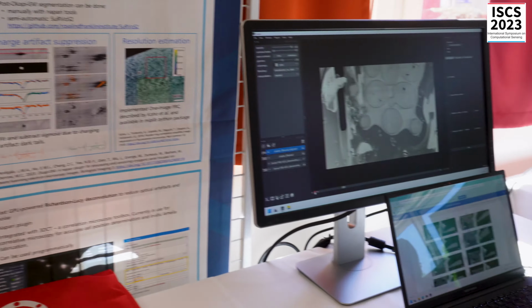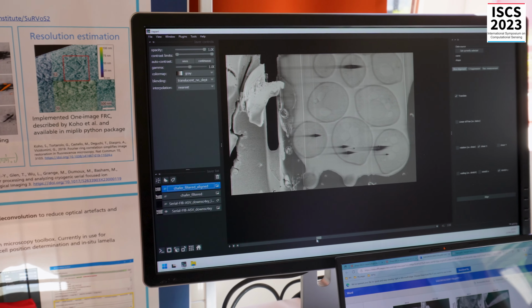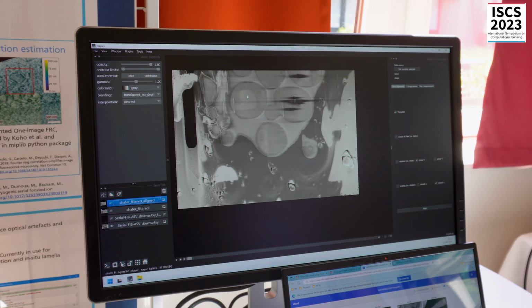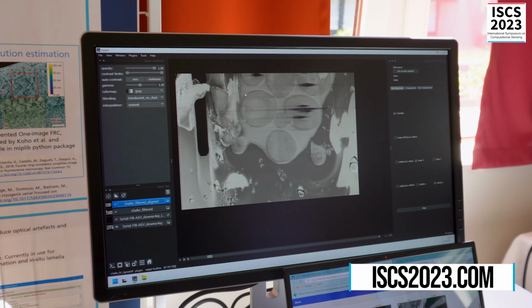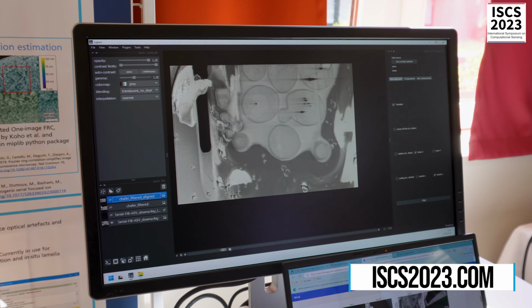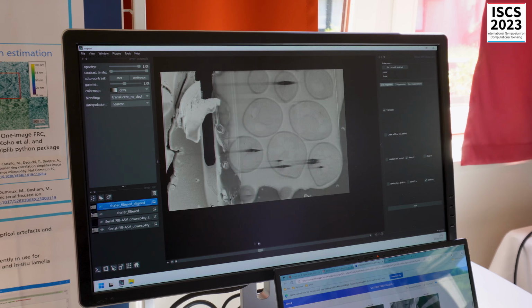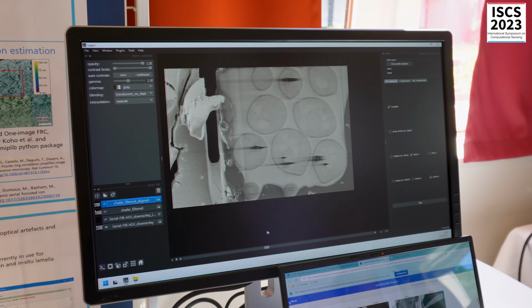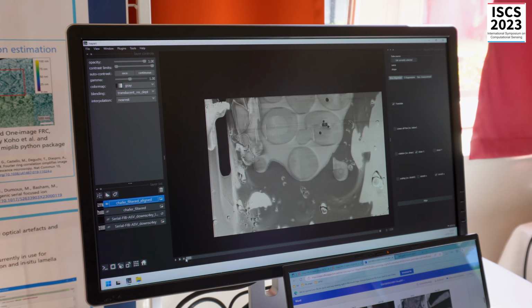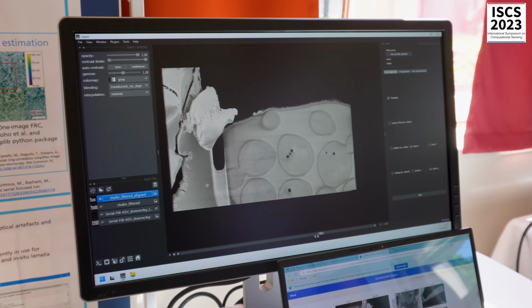I'll show a quick example here of data from that. So this is how our original data looks. Going from the top to the bottom, as you cut slices through your data, this is yeast cells, and the charging artifacts are in this. You can see that it looks good as you go to the bottom slice, but there are two problems. One is too much movement, and the other is these charging artifacts. If you apply both of these tools, you end up with something that looks like this. It's much better corrected. So after that, you can do segmentation and so on.